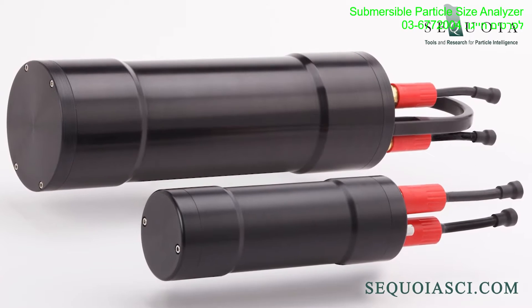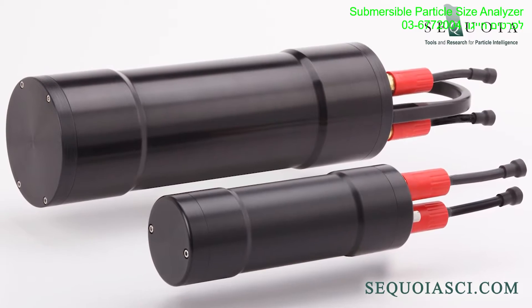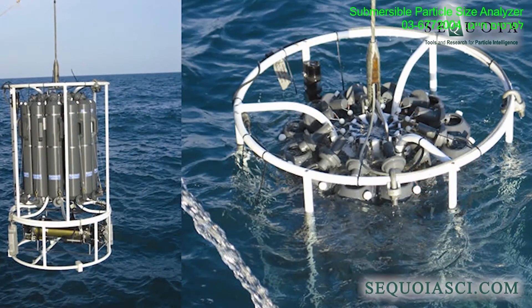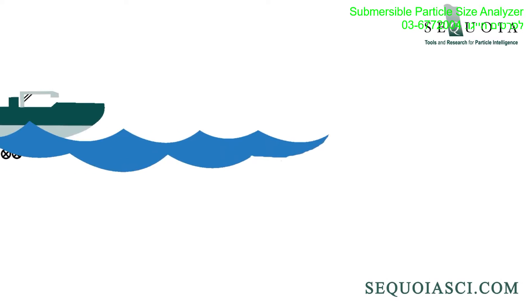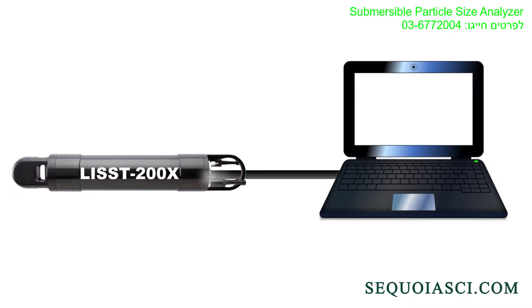First, the LISST-200X comes with an external battery pack, so the instrument can operate completely on its own. Just program it and secure it to a CTD or other profiling platform, or lower it on a rope in its deployment frame. When you have completed your profiling, offload the data and process them with the LISST-200X software to see the complete data.